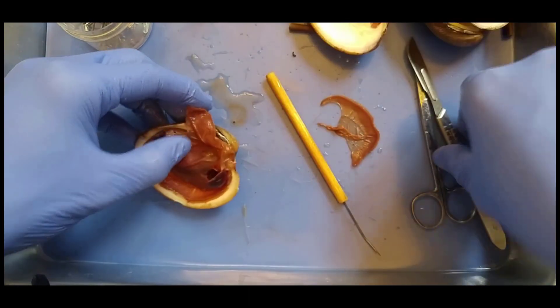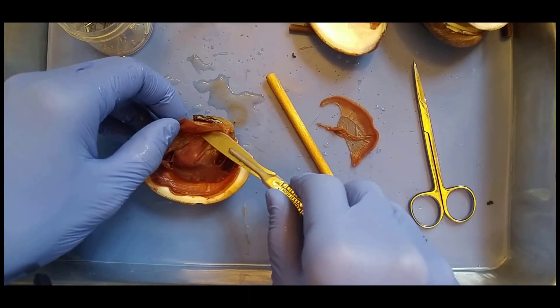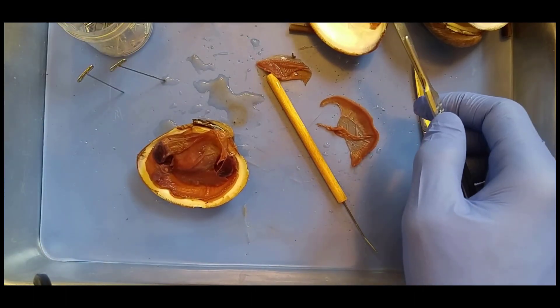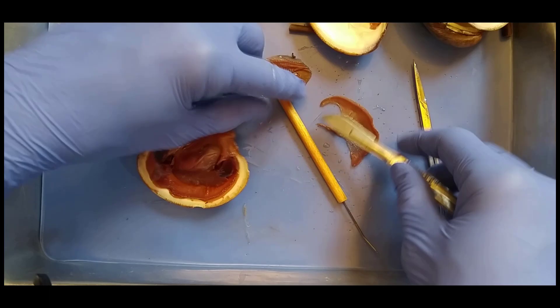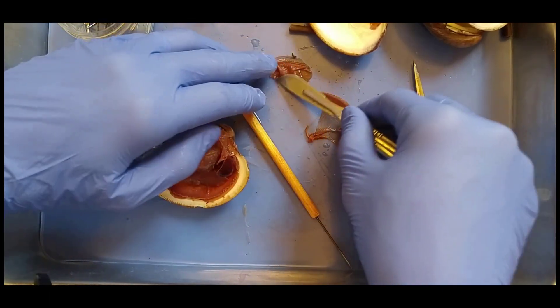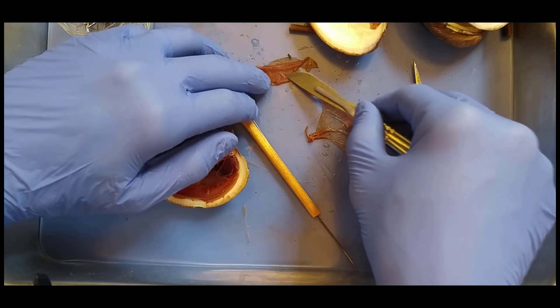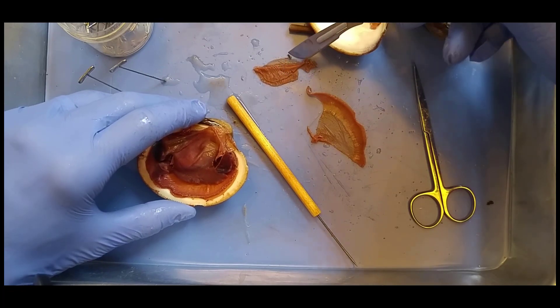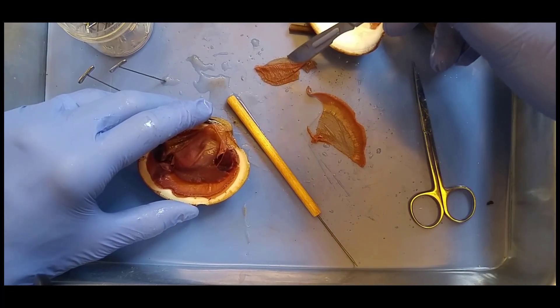So let's go ahead and slice the gills out. We'll put them here so you'll be able to differentiate the mantle from the gills. So the mantle secretes the shell. What do gills do?